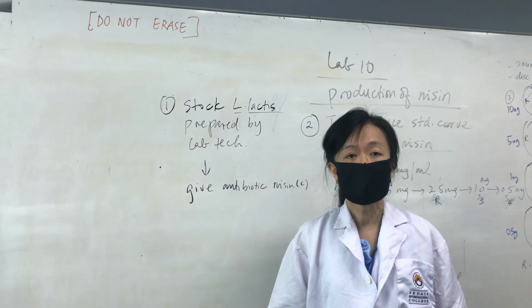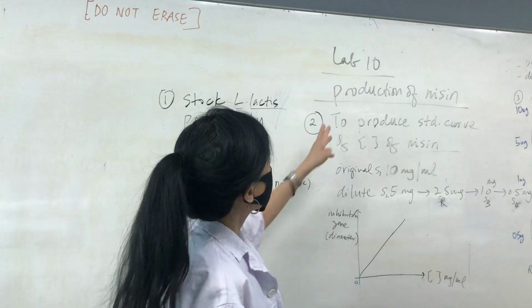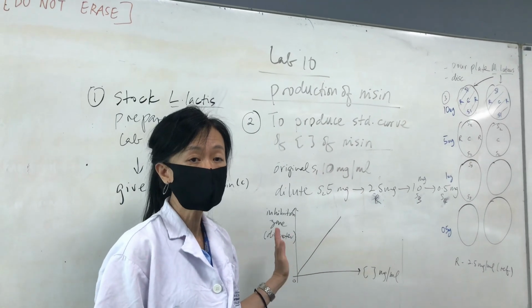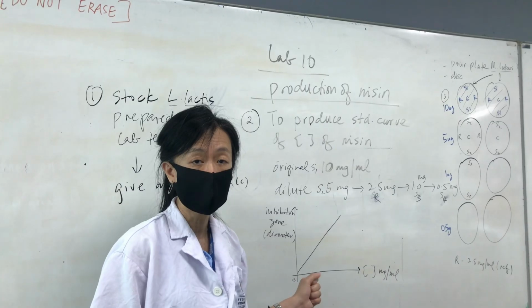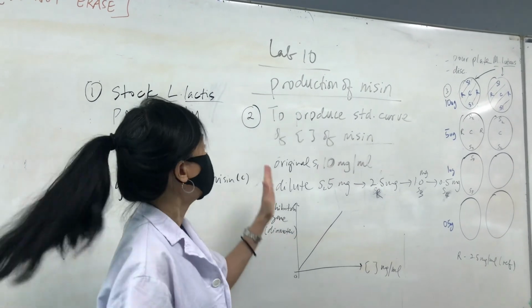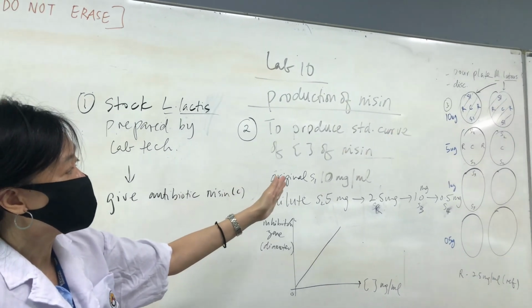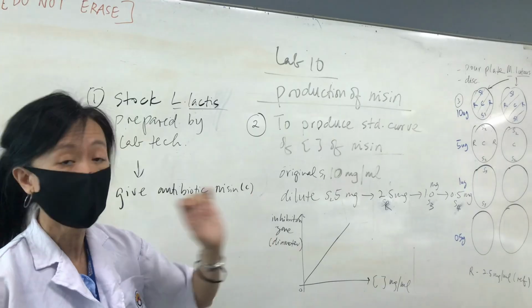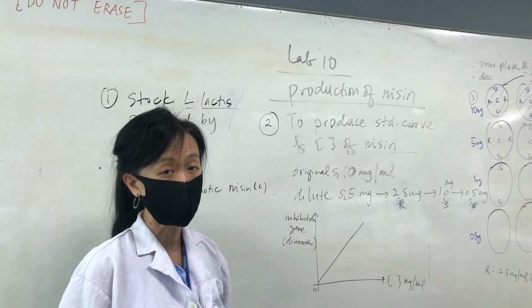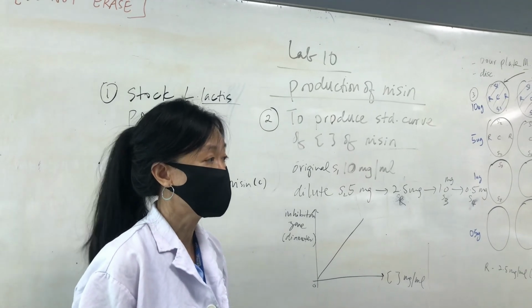Everyone, today we are going to do lab 10, which is the production of Nisin. Miss Lauren, the lab technician, will explain the procedure, and later she will also show you the hands-on application, and at the end she will show you the results. I will hand over to Lauren now, Miss Lauren.